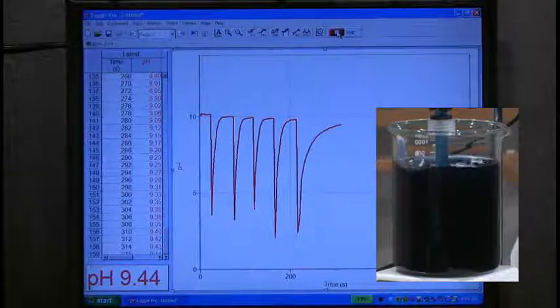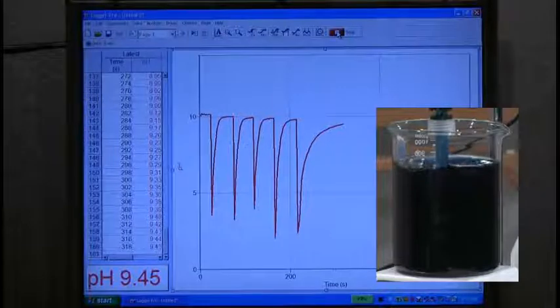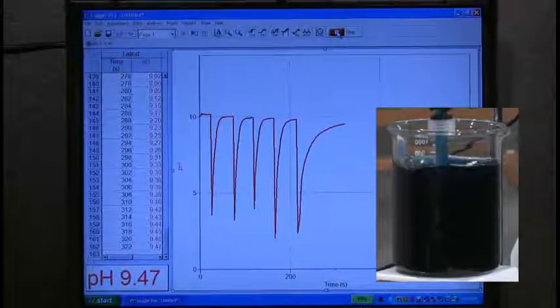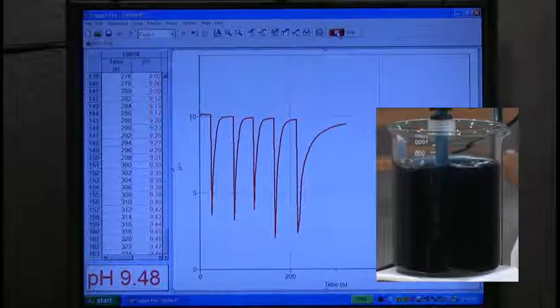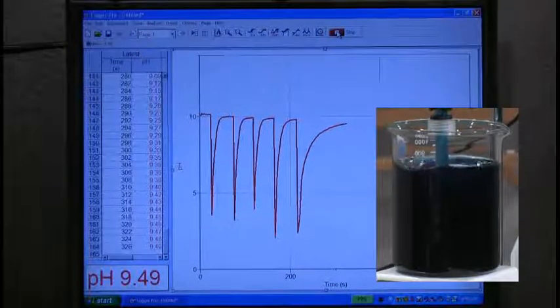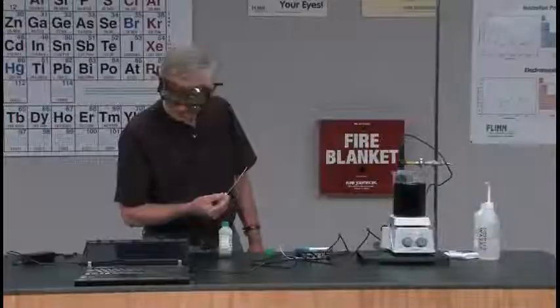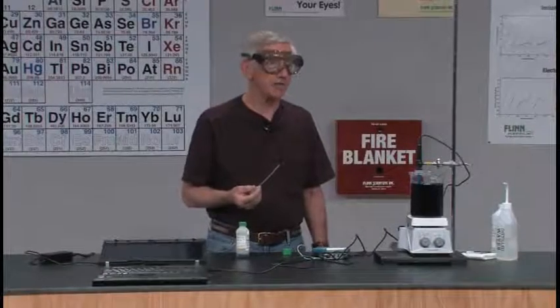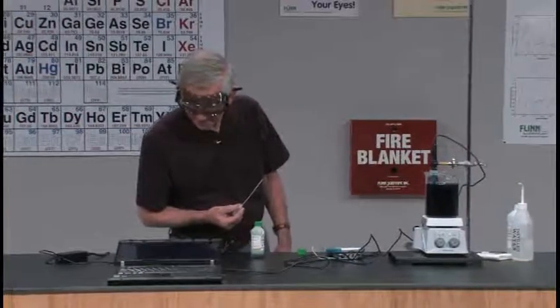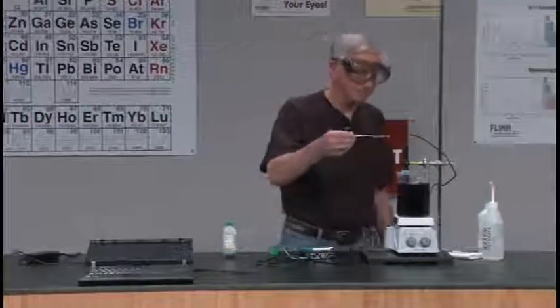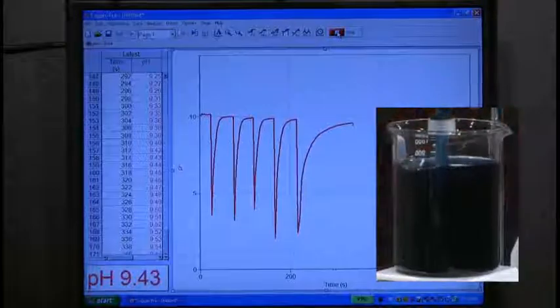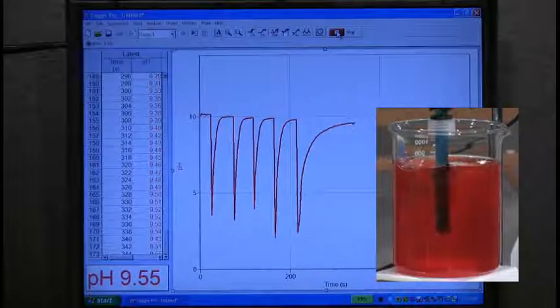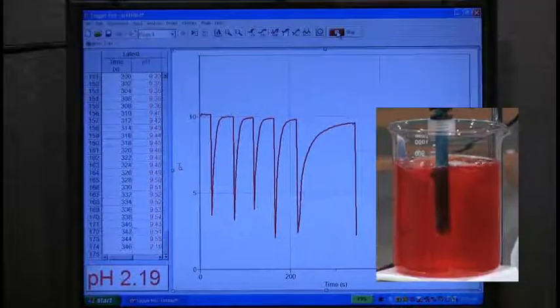Did you hear me say I was waiting for you to level off? Would you do that, please? Oh, okay. I'm sorry. I misunderstood. You always talk to your reagents. You let them know that you're on their side. Okay, final, guys. Crank this up. And it's red.